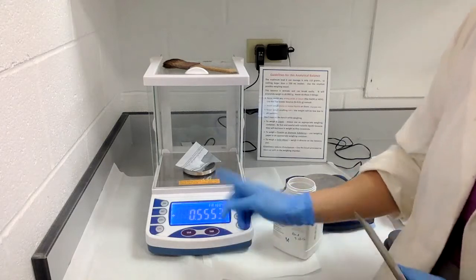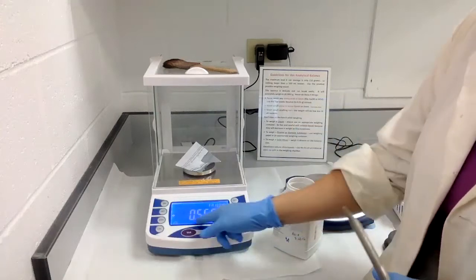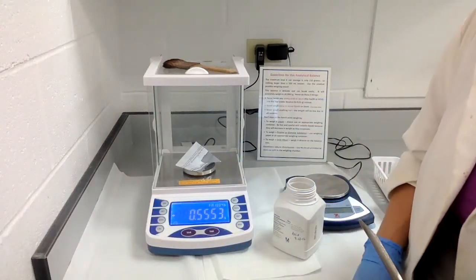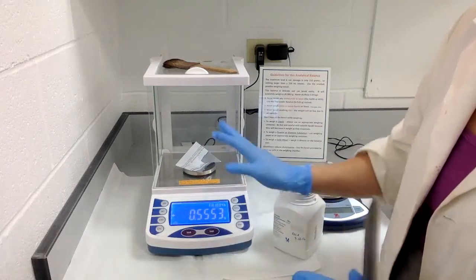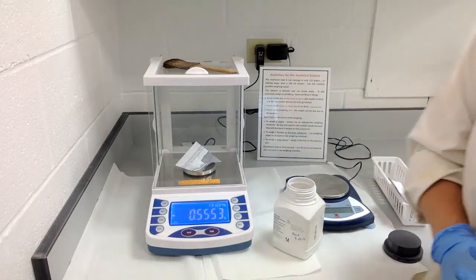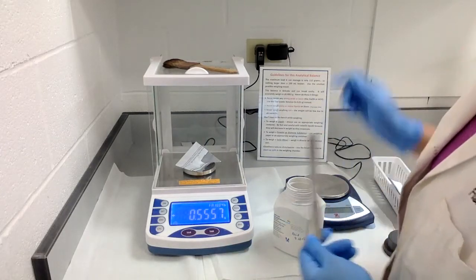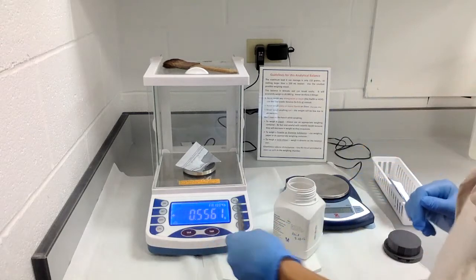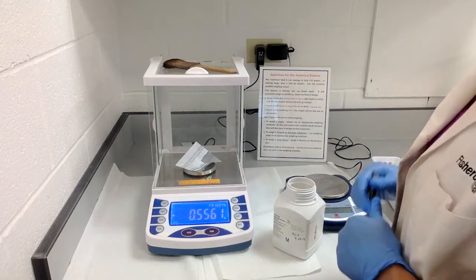One important thing to note: if you're using an analytical balance, it has four decimal places, and you should always record every single number you see. Don't just say 'this weighed 0.2 grams' and stop there. You need to make that accuracy known in your lab notebook. Never truncate your values — always write down every decimal place you see. The same applies to the top loading balance.